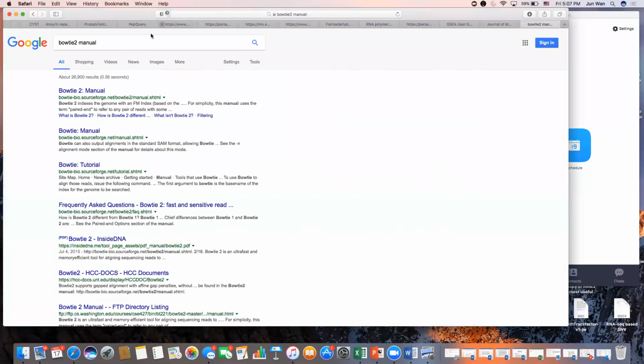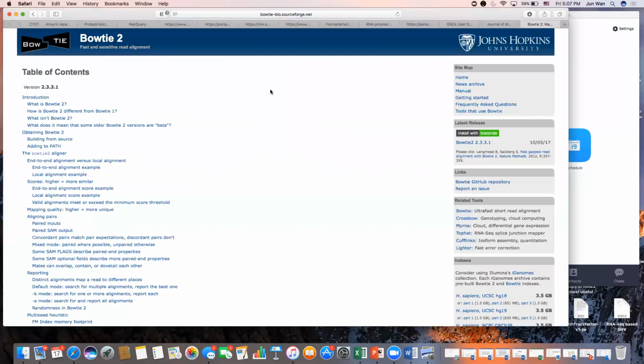For me, the most obvious place to start is your Bowtie 2 manual. And again, this has been loaded. This is a document that's been loaded for you guys. It's been sent to you, but it's also online.